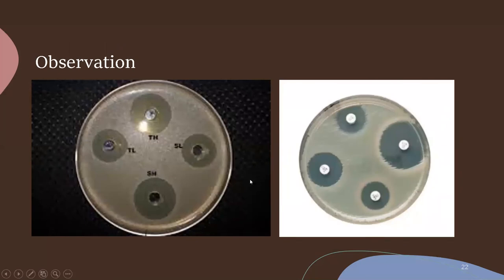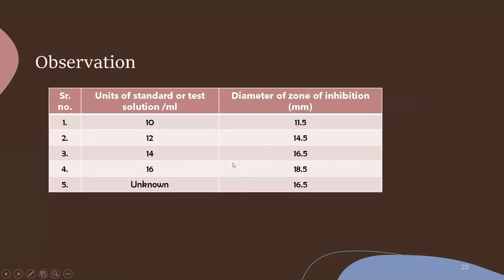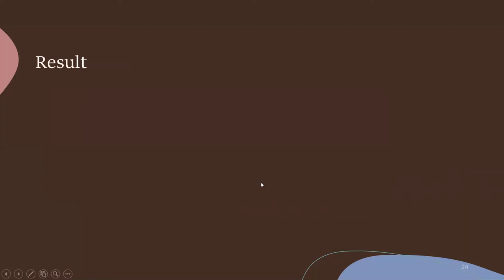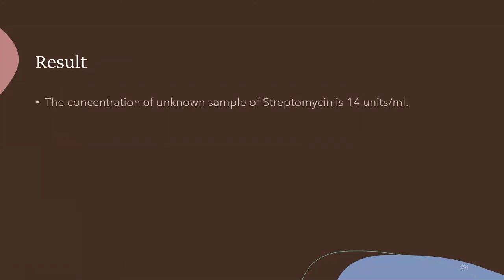Observation: for the cup plate method you will get zones of inhibition around the cavities, and for the filter disc method you will see zones of inhibition around the discs. Mark with a marker and measure the zone of inhibition using a scale. The results obtained show the zone of inhibition for the unknown was 16.5 mm. From the calibration curve, the concentration of the unknown test antibiotic is 14 units per ml. The microbiological assay of streptomycin was successfully performed using the cup plate and filter disc methods.